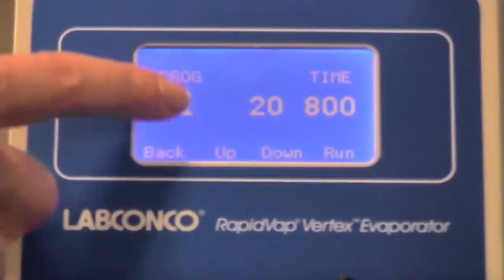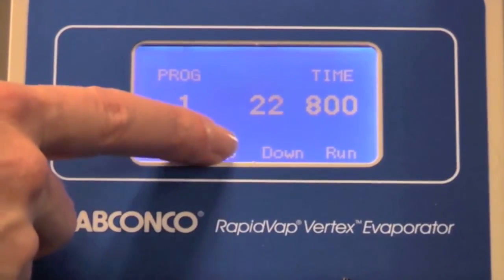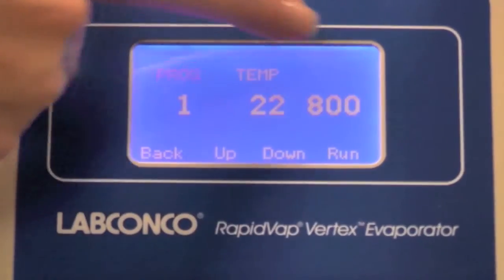The touchpad control allows easy programming of time and temperature, and up to 10 user-set programs.